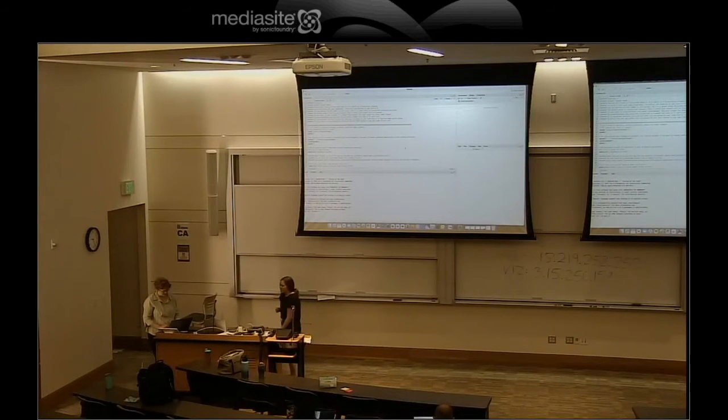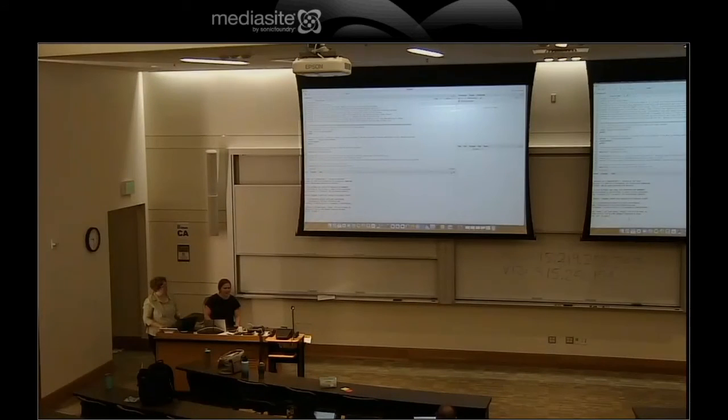Generally what's in RStudio is you have this top piece, which is your script itself. This gets saved as a .R file typically, but as you know, extensions don't matter all that much. Here is your console. This is like your command line, like what we just did. Nothing here will be saved, but it's good for running quick things, like if you're trying something out.